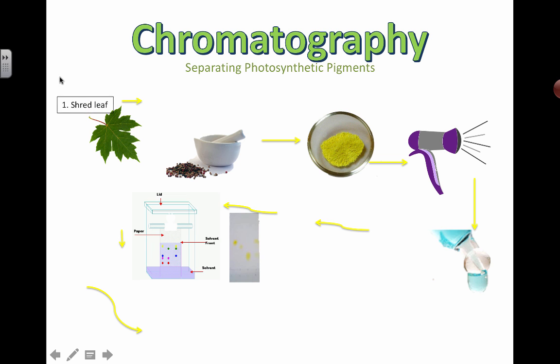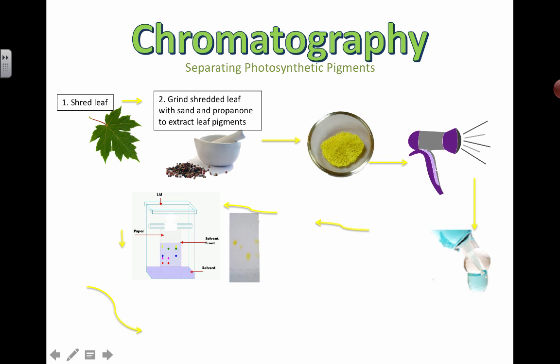So we're separating photosynthetic pigments here. You're going to take your leaf, shred it, grind it all up, and use sand to help break apart the cells using surface area. You're going to use propanone, which is one type of solvent. You can use different types of solvents — if you search online, lots of different solvents are suggested. Ethanol is used as well.